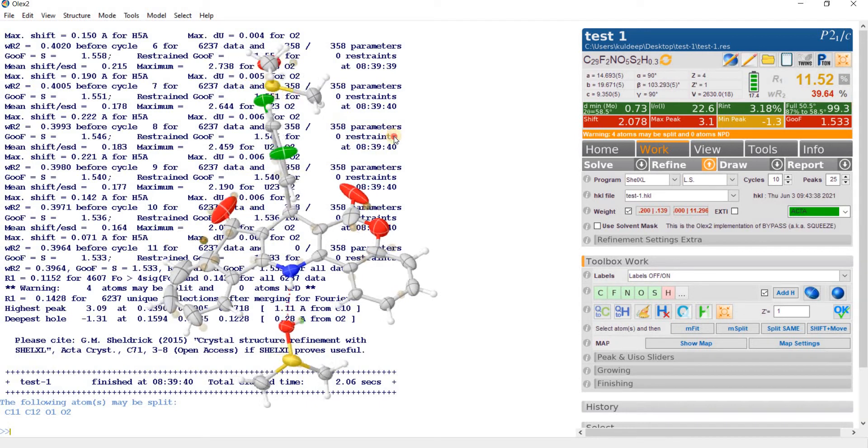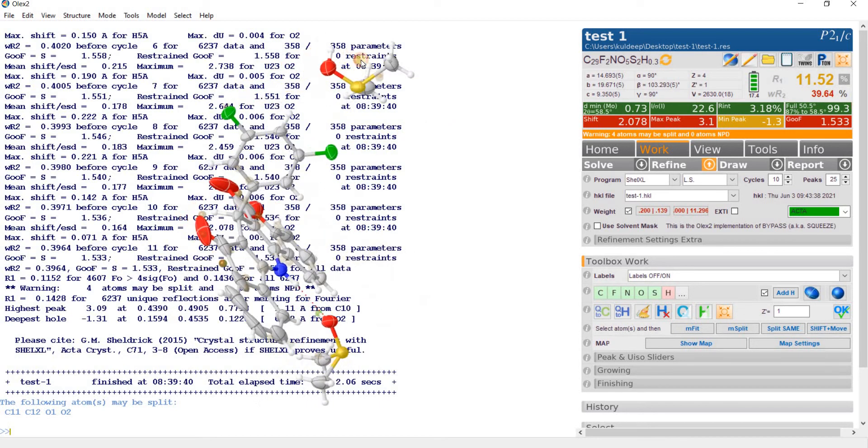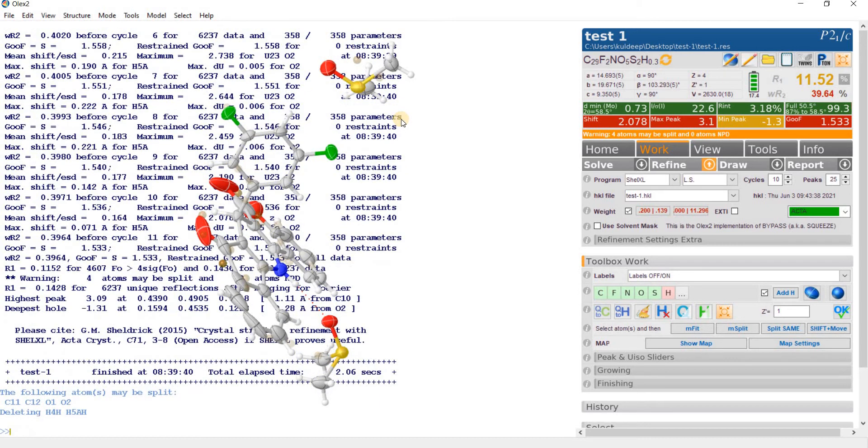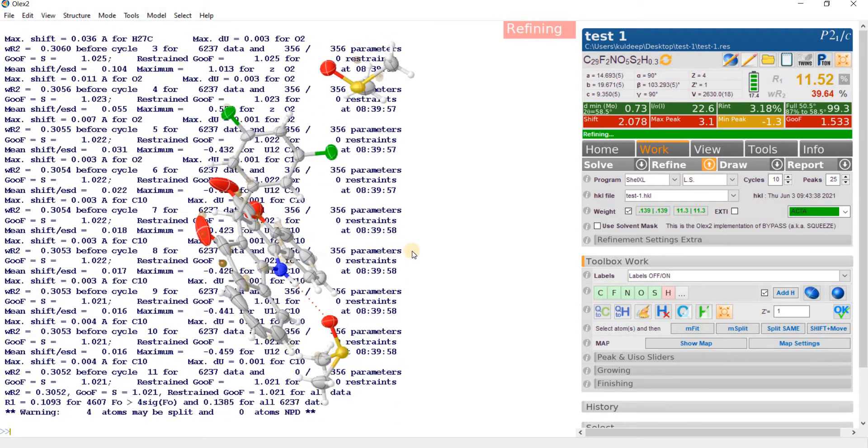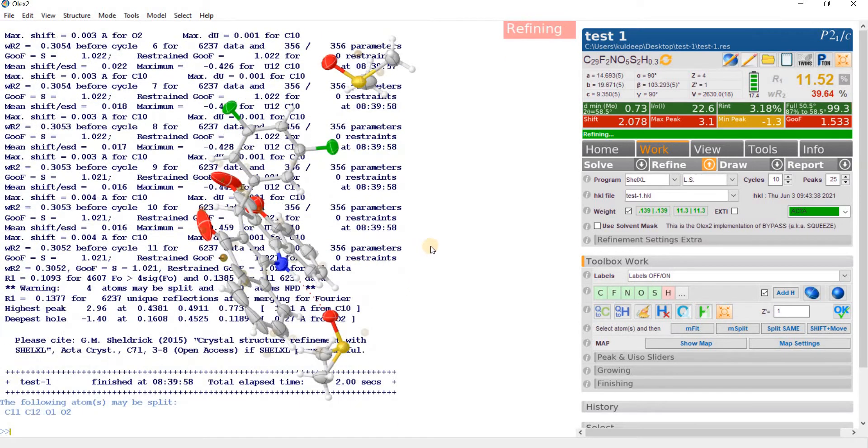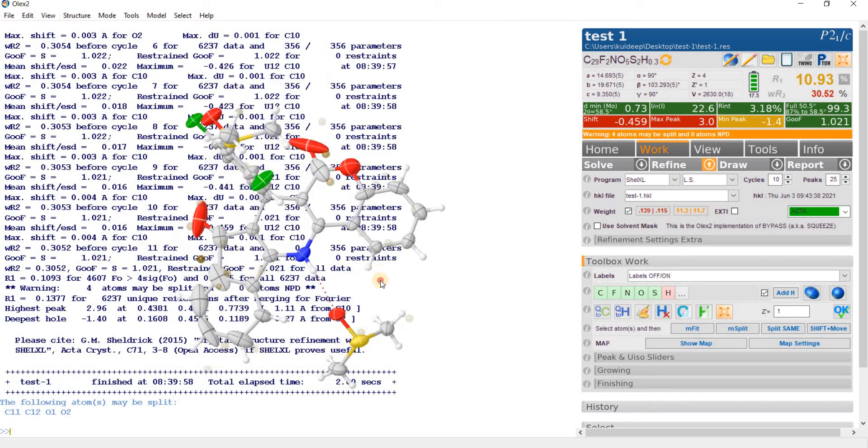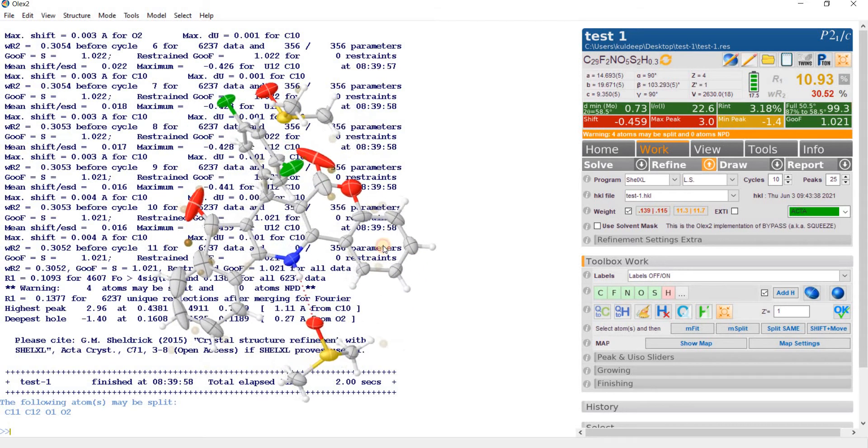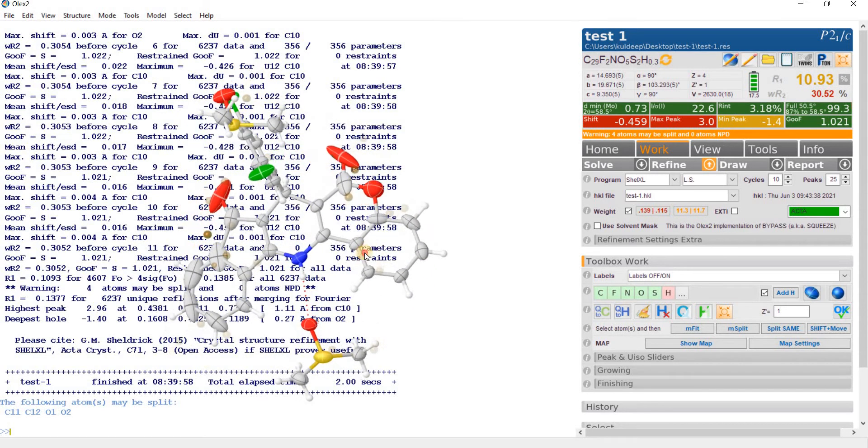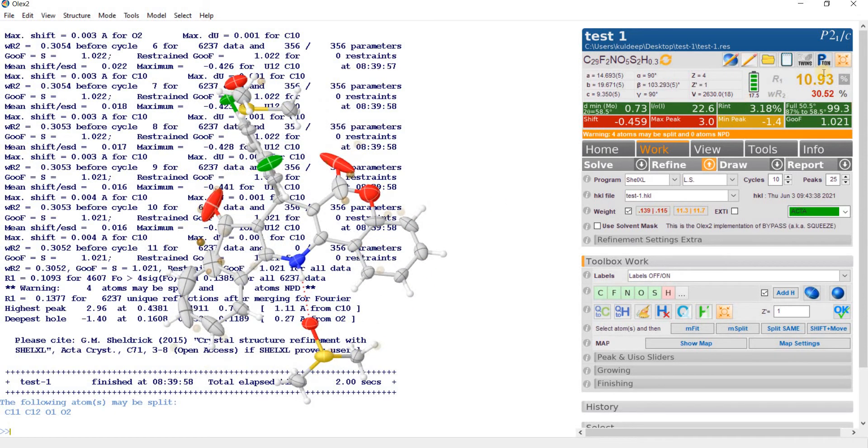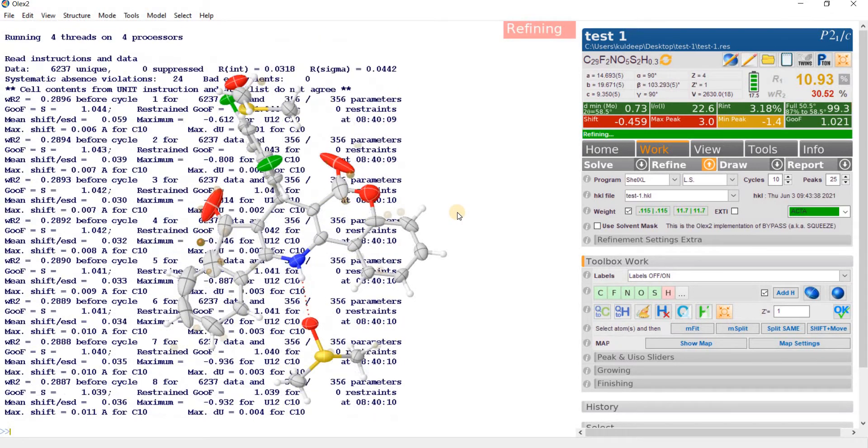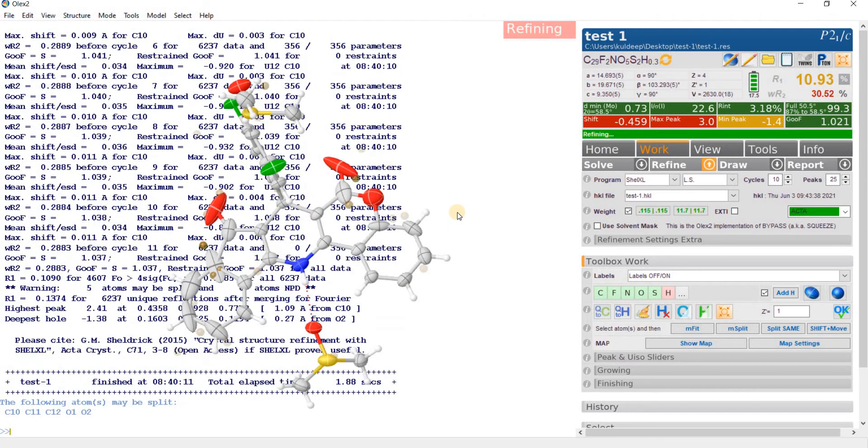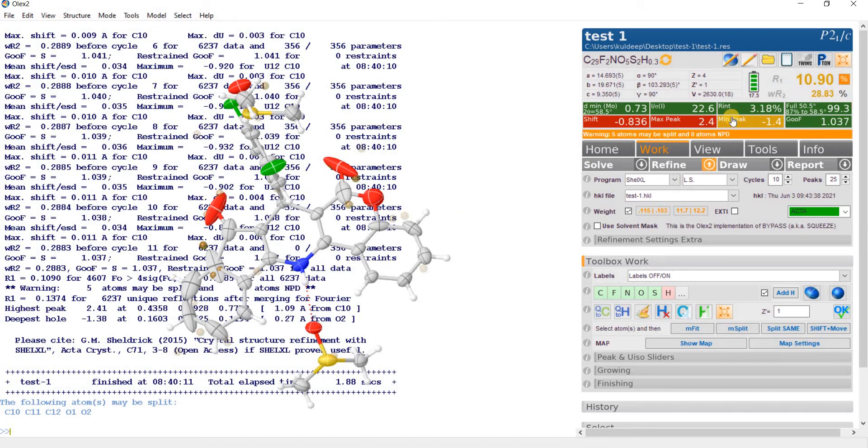We have to delete these two hydrogen and refine one more time. So R factor is not getting down. It is constant around 11% and we are not observing any drop in the R factor.